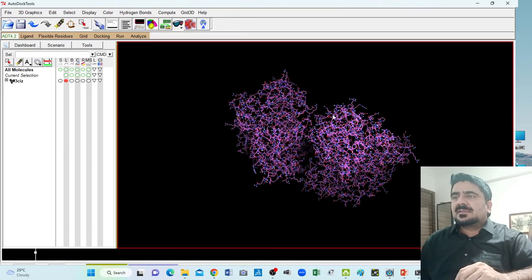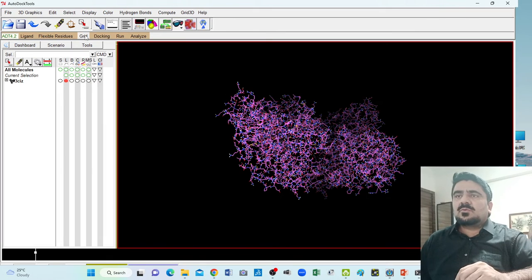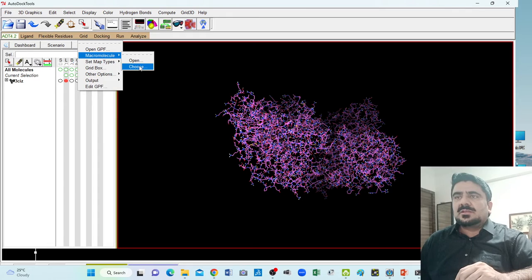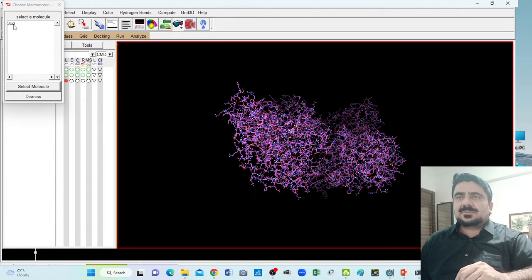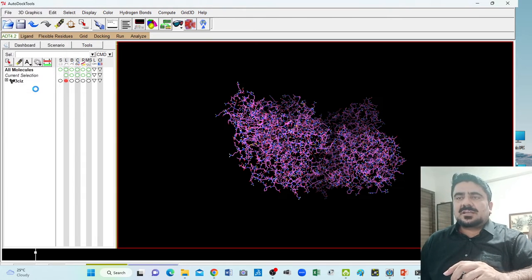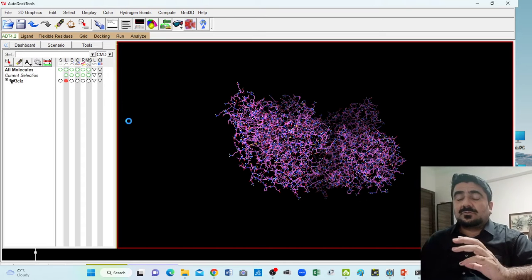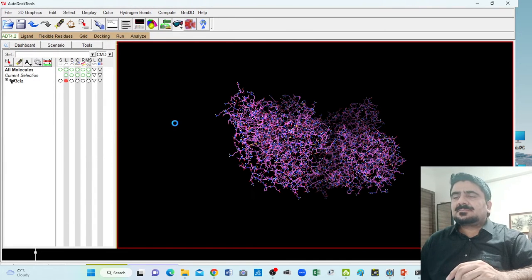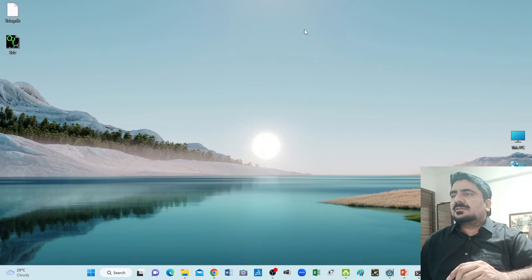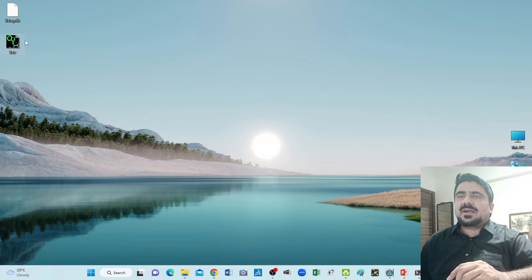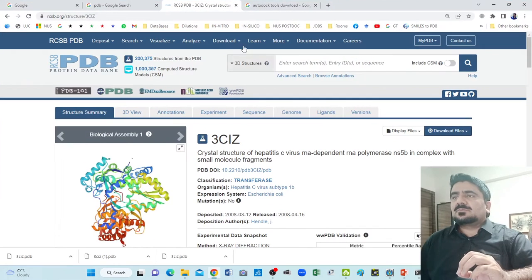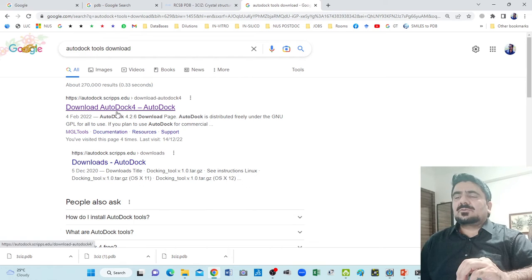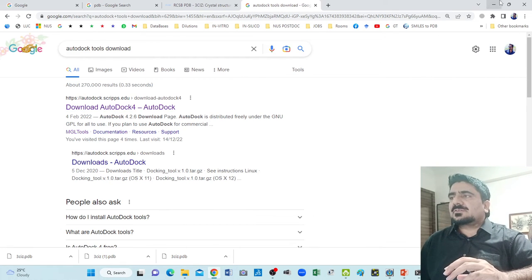Now to download this file to your desktop, go to Grid, then Macromolecule, and click Choose. Here on the desktop is your protein — the PDB file name is 3CIZ. Click and Select Molecule. The next step is to give the path where you want to save it. The file shown is a PDBQT file — move to the desktop and save it. By this procedure you can easily download your PDBQT file. You can get AutoDock Tools by searching 'AutoDock' on Google to download and install it on your laptop or PC.